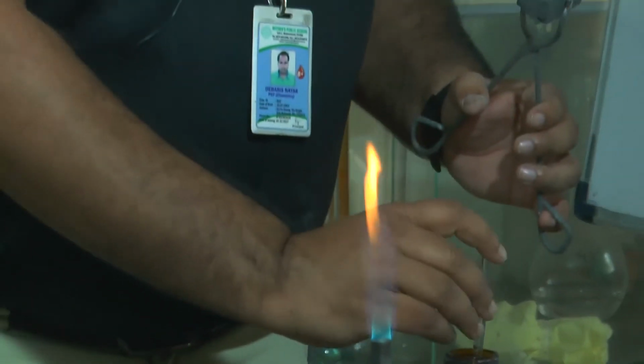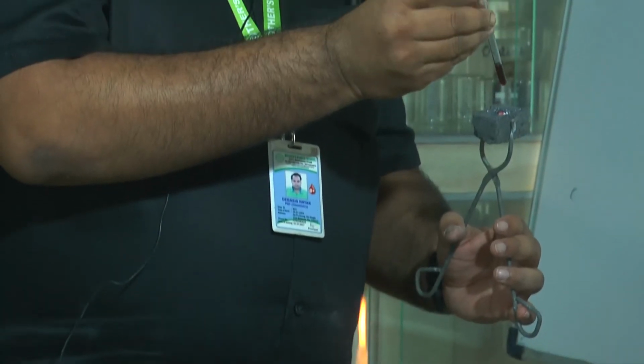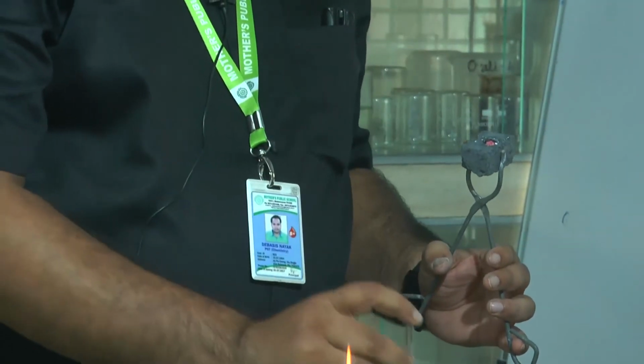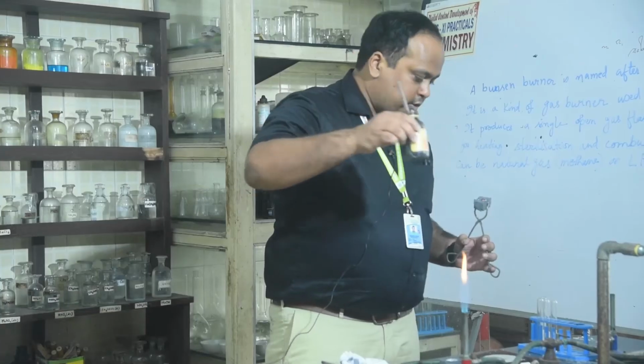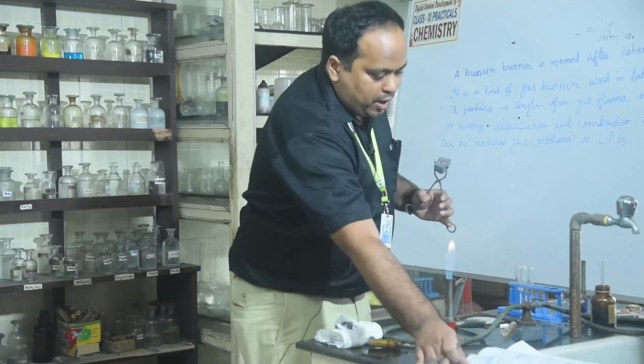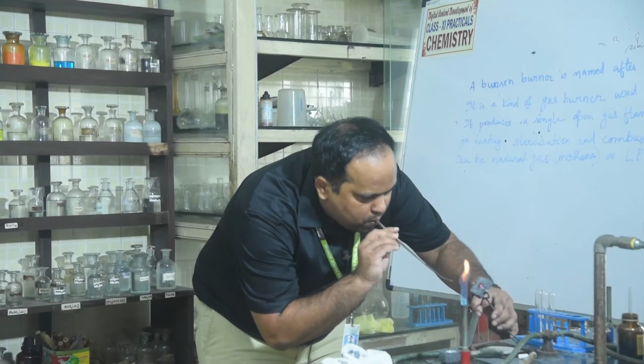You can see this is glowing now. Now I am just putting 1-2 drops of cobalt nitrate. So this is your cobalt nitrate. I am putting some cobalt nitrate here. Again I have to blow this. So if I blow this, then what happens? I have to see.